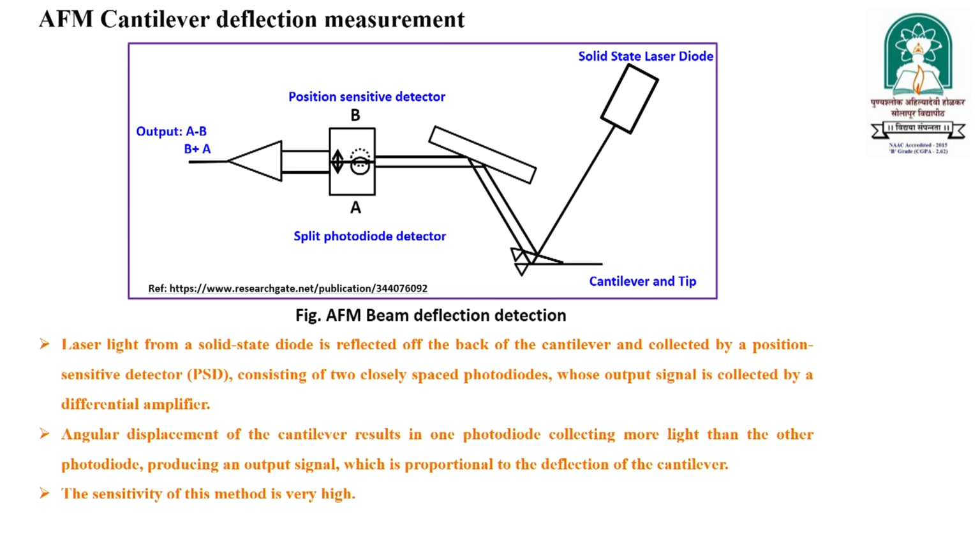Next is the AFM cantilever deflection measurement. The cantilever deflection measurement has one common method, and that is the beam deflection method.